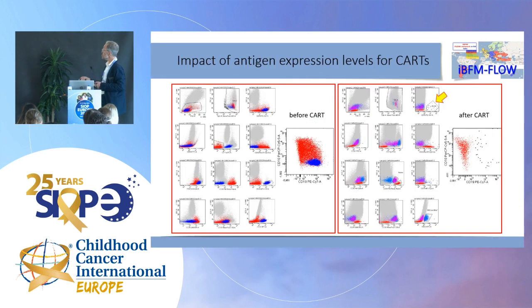And it's also important before you start the CAR cell therapy that you think, how good is my expression? How strong is my expression? How entire, or partially expressed? So this is why I'm saying partial expression, strong expression, weak expression is not for fun, you know? You build something on it.